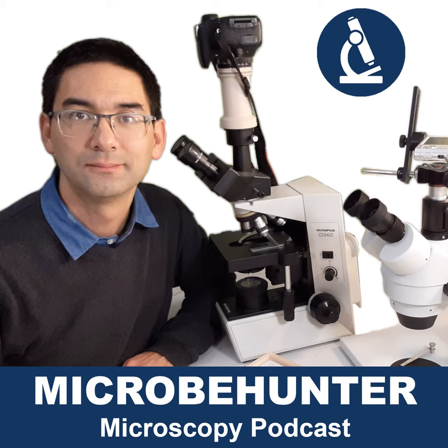Let's say I want to look at this paper clip under the microscope. This paper clip is opaque. It is relatively large and it's made of metal, it does not allow any light to go through. So I can use a stereo microscope to look at this specimen, and I can see the scratches and the dust and the dirt and all the little details on its surface.